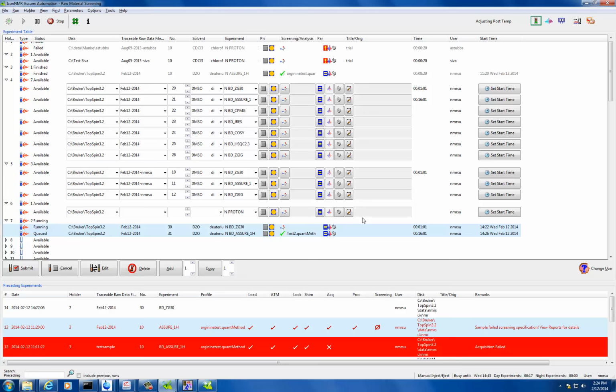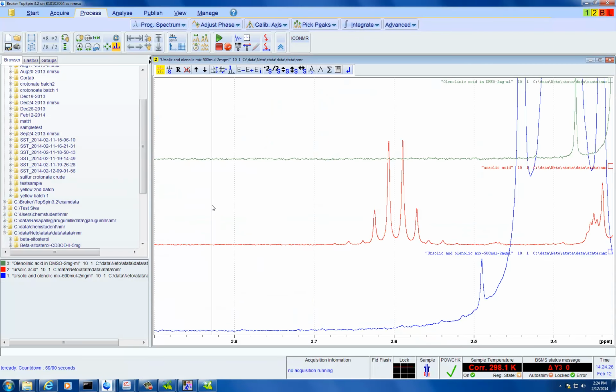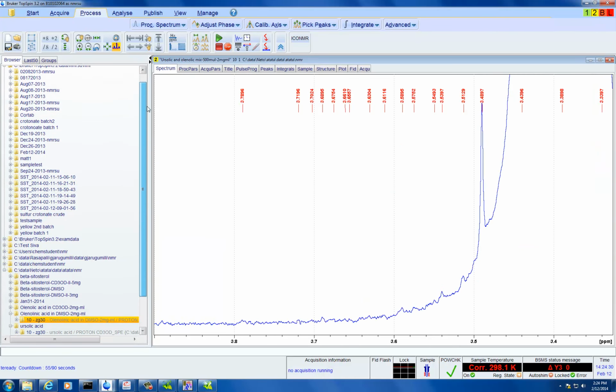Sucrose and glucose, because those are metabolites that vary in the samples. We only looked at the 2010 ones, but they would vary as well between lines. Do you want to see my spectrum? Yeah, sure. When I saw it on there, it just had those three.